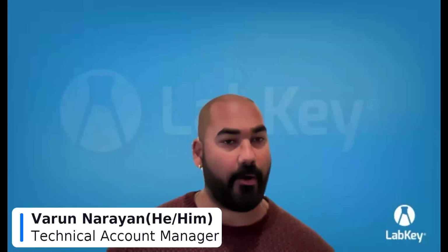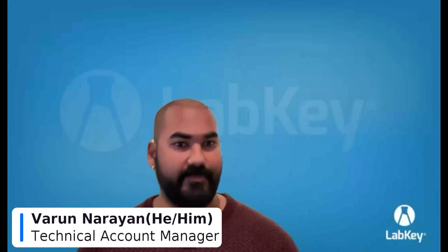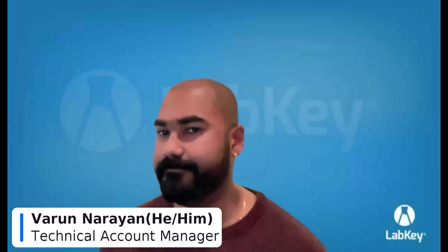And like Adam was talking about, some additional features that you have access to. I wanted to go into a brief glimpse of our built-in ELN and some of its features. Our ELN can be used for a number of different things, but for the purpose of this example, I'm just going to be using it to quickly document steps of a very simplified DNA sequencing experiment. So let's go ahead and get started.